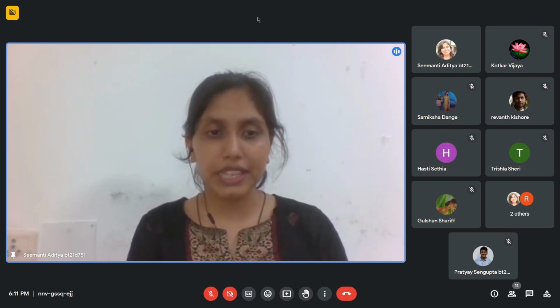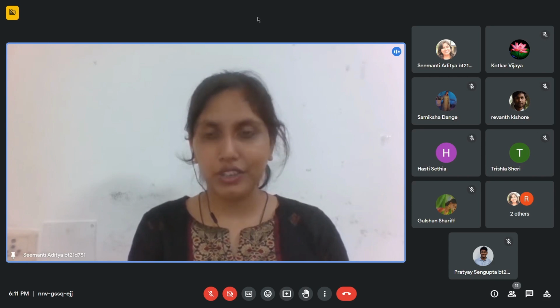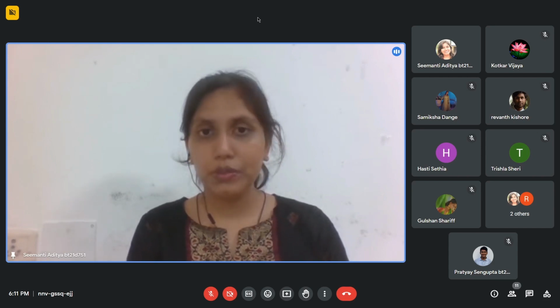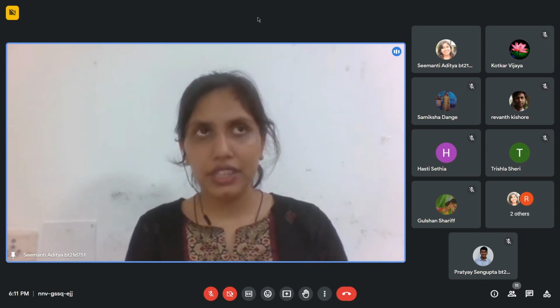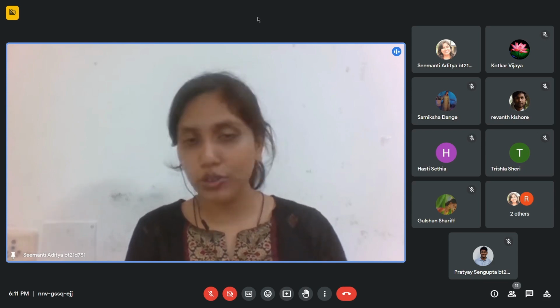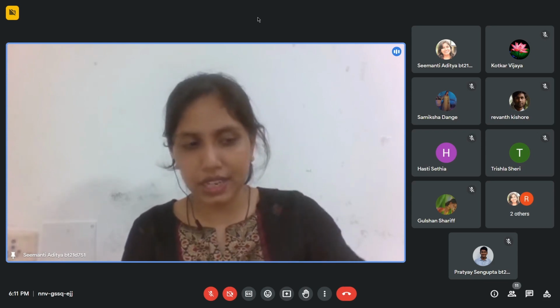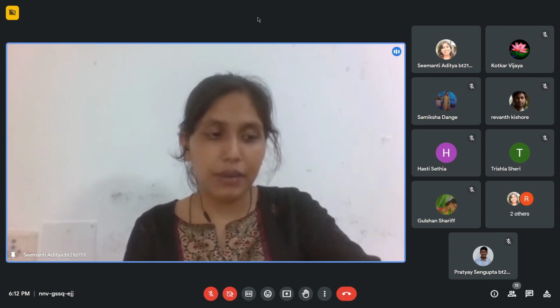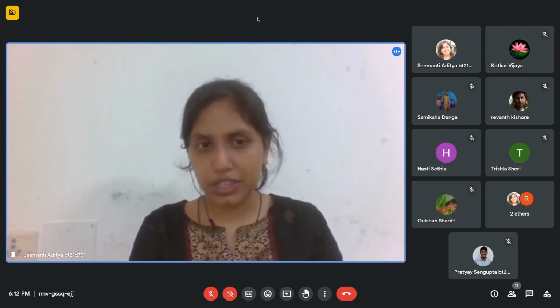Also, another important thing is the microscopes. This is the heart of cell culture. We have to have proper, good microscopes to see whether the cells are in proper morphology, whether the cells are healthy, or whether the cells have any contamination. So we definitely need microscopes, and it is better to have a fluorescence microscope inside the cell culture room. But if a fluorescence microscope is not available, at least a bright field microscope is very, very important.